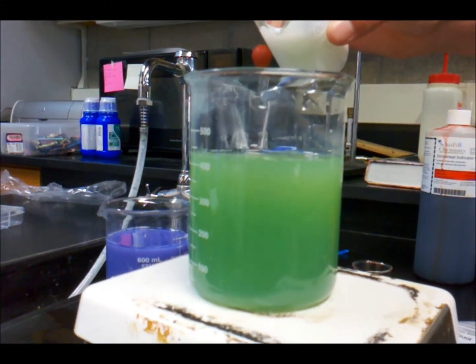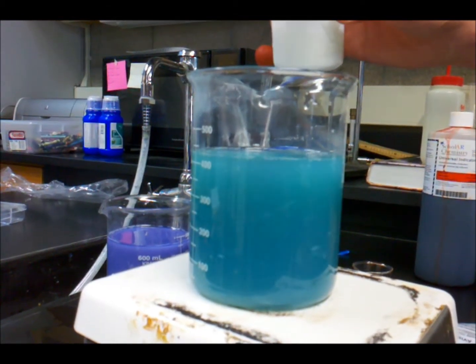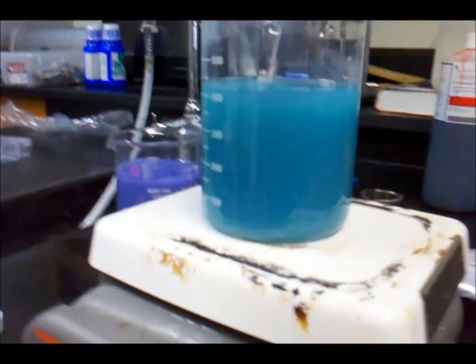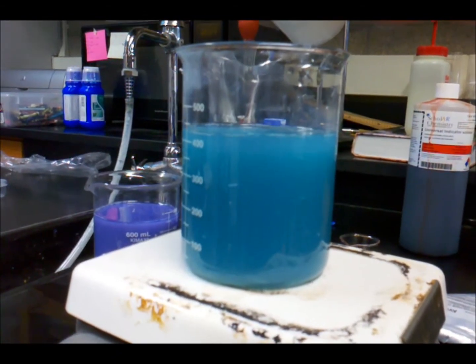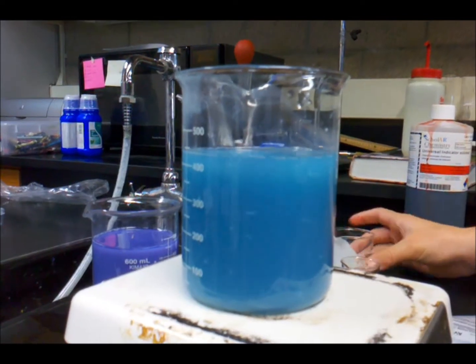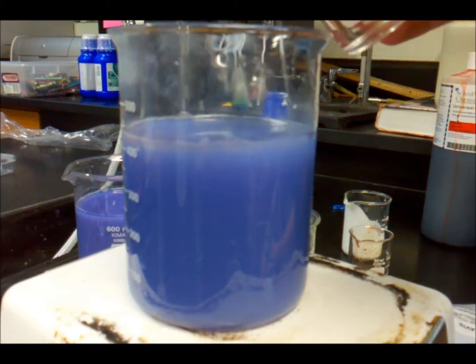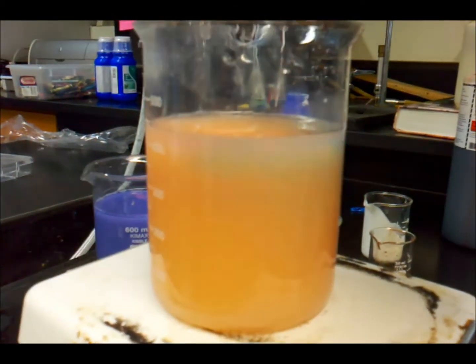Hey, wait. On the bottom, it's blue. A little bit. Oh, nice. Alright. Let's see what happens when we add vinegar to it. Oh, nice.